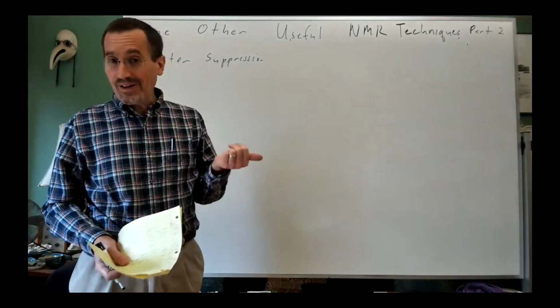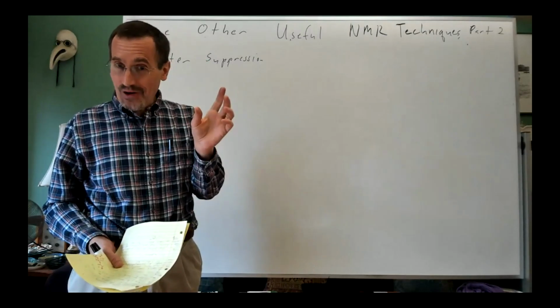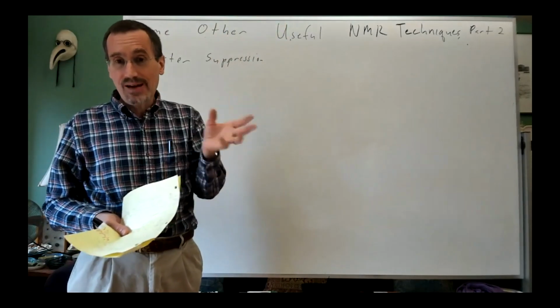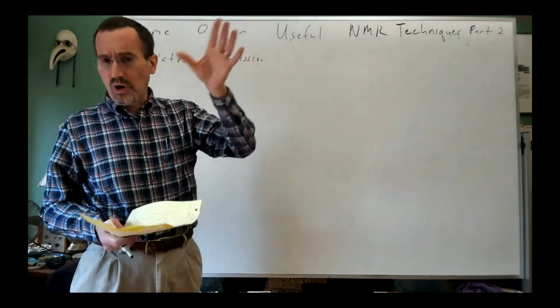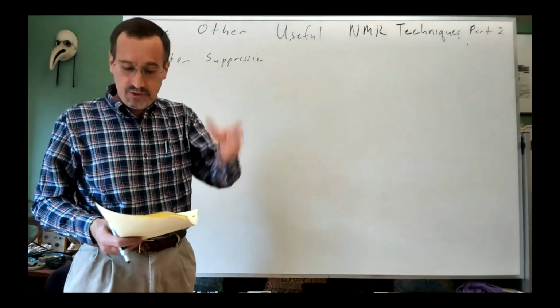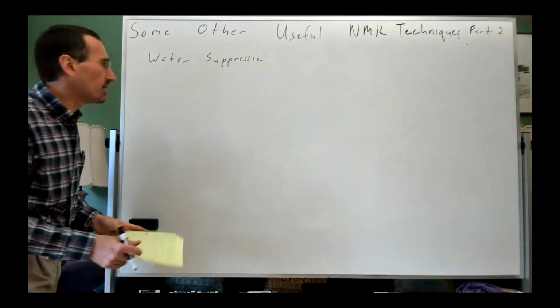But water is 55 molar H2O. So that means you have 100 or 110 molar of protons. They are going to dwarf, they're going to saturate your spectrum compared to your millimolar concentration of compounds. So you've got to make the water peak disappear.